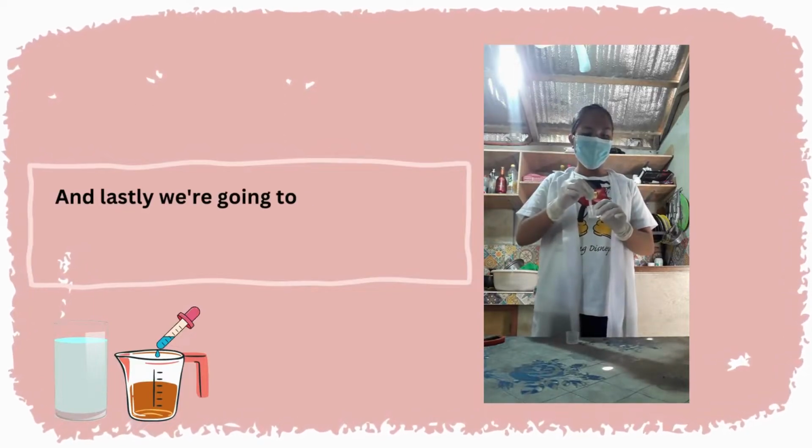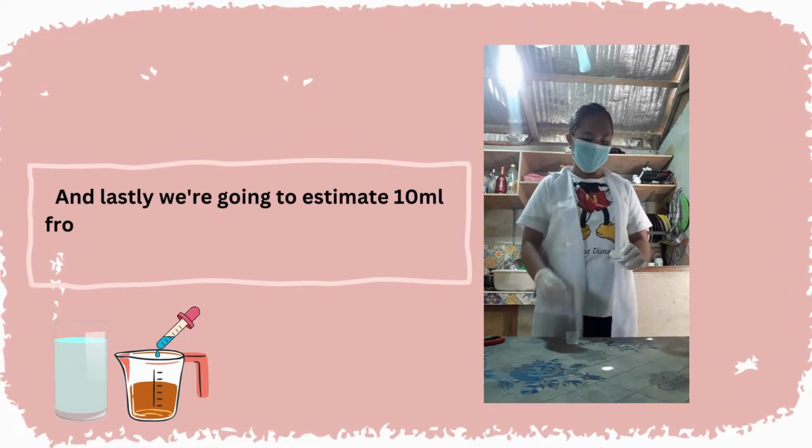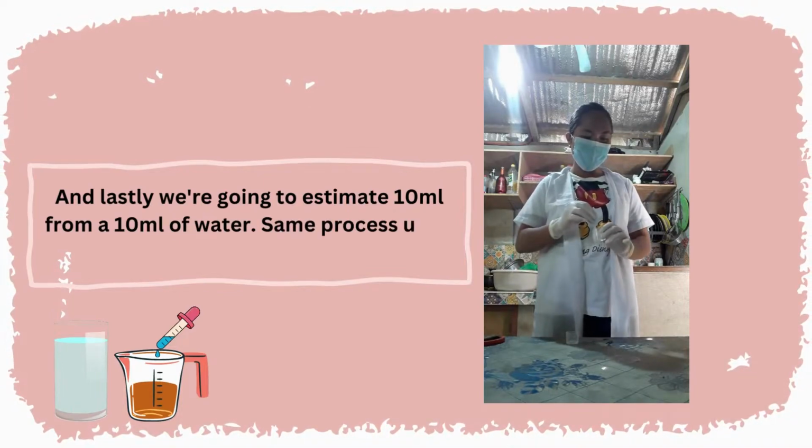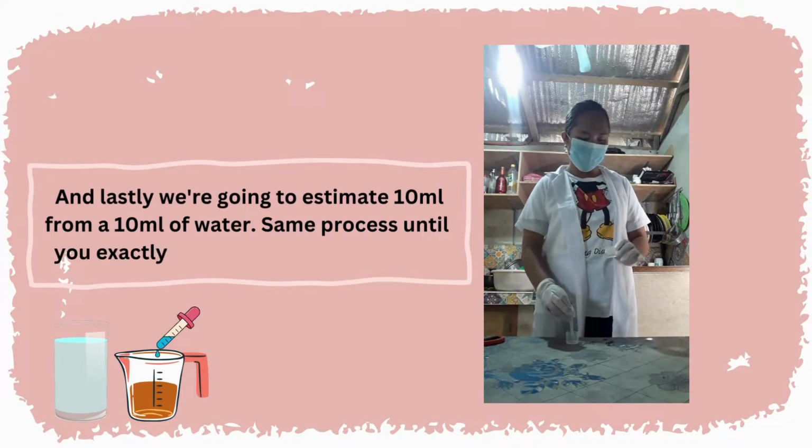Then lastly, we're going to estimate 10 ml from a 10 ml of water. Same process until you exactly estimate 10 ml in 10 pumps.